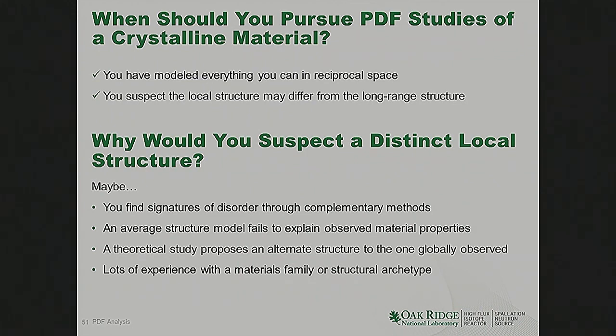You may be asking, well, when is it right for me to try that technique out? I would say, I guess I should preface that with: if you have a disordered material or nanostructured material, you should do PDF. That's the way you can look at the atomic structure. For a crystal material, it's a little more nuanced. When do you know that PDF's appropriate?